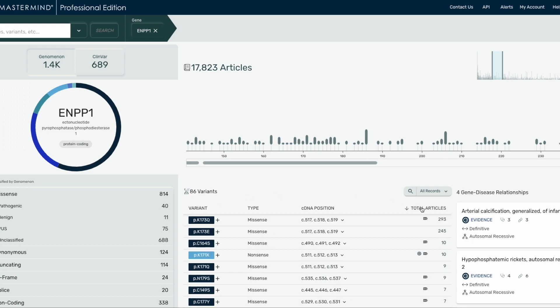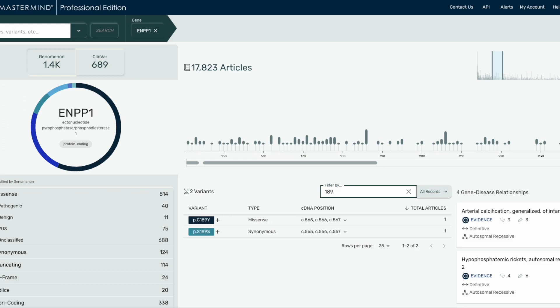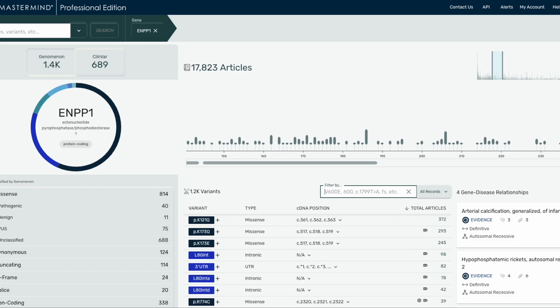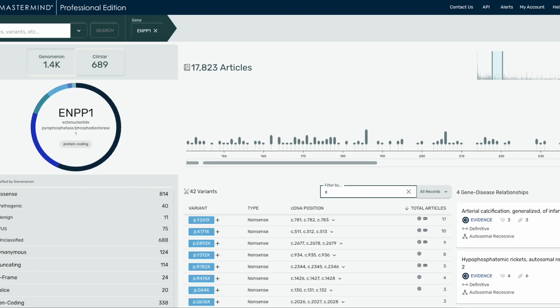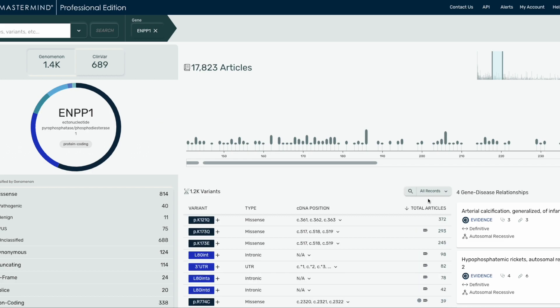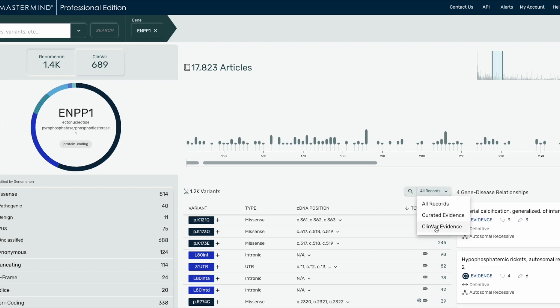You can still perform other search functions you're used to in Mastermind, like typing in a specific amino acid position or typing in X to filter for all nonsense variants. A new feature we've added is this records filter, where you can filter by all records, curated evidence, or ClinVar evidence.